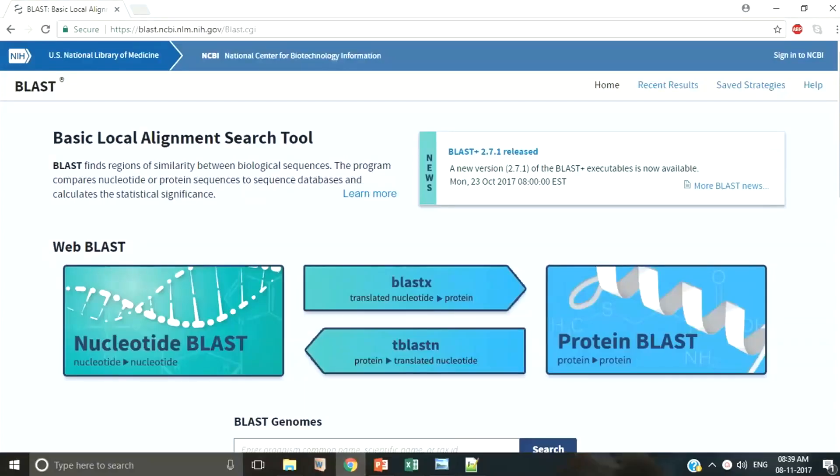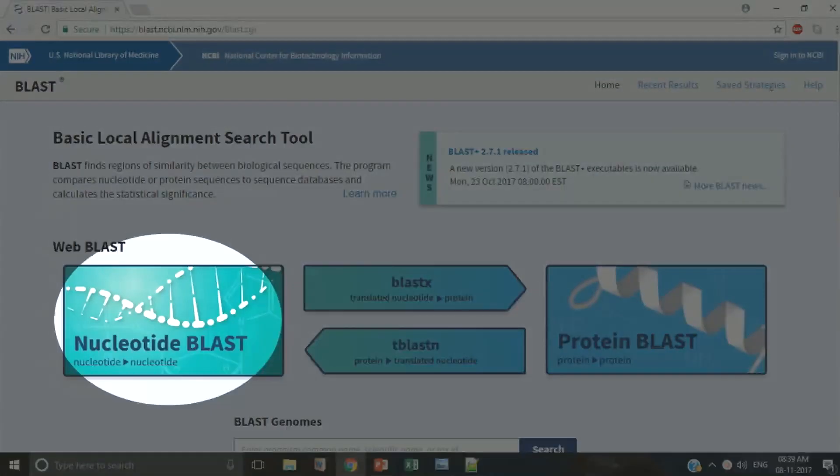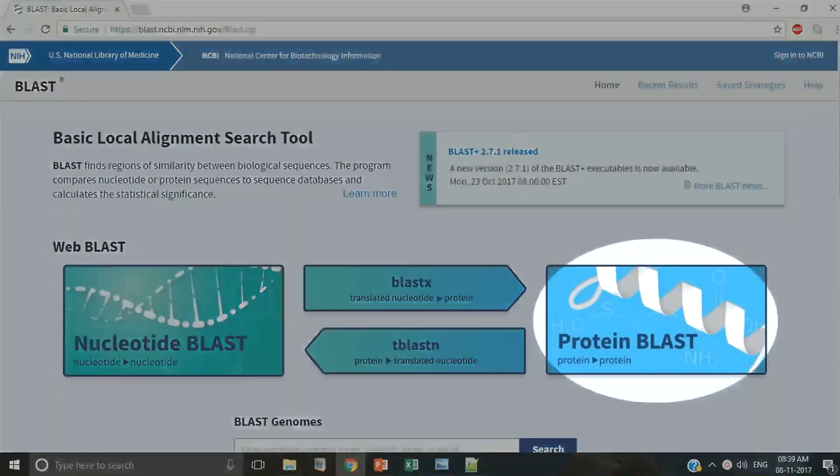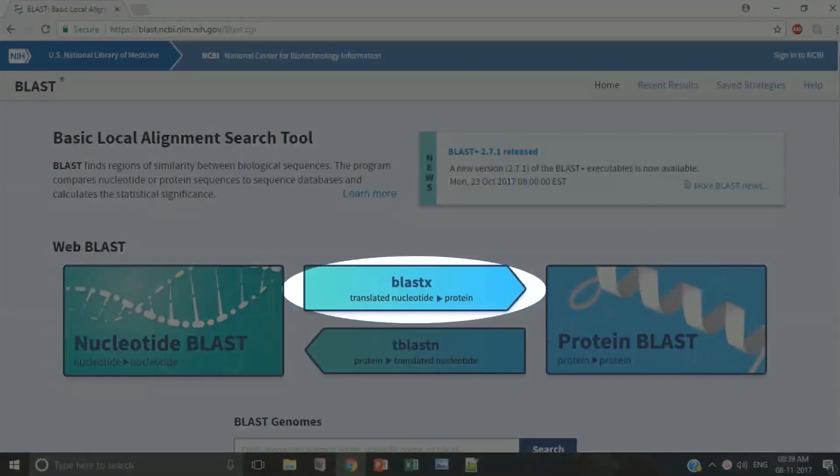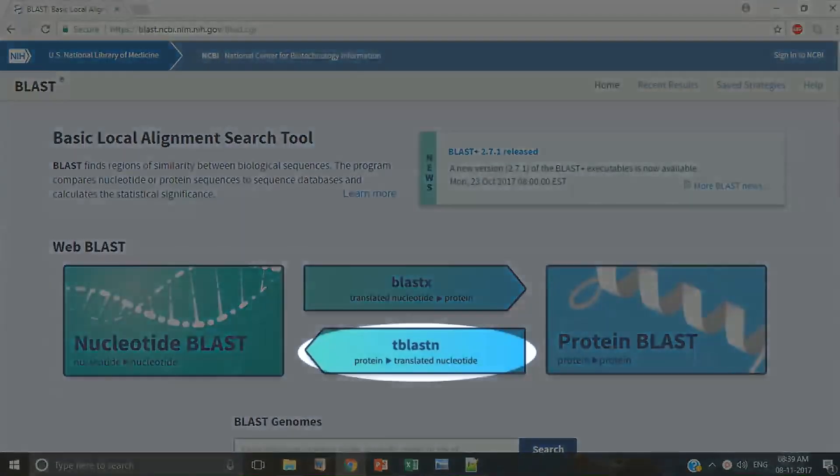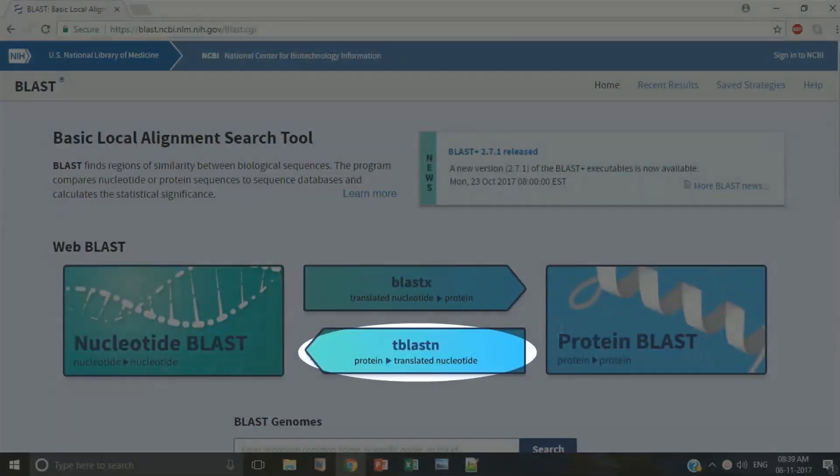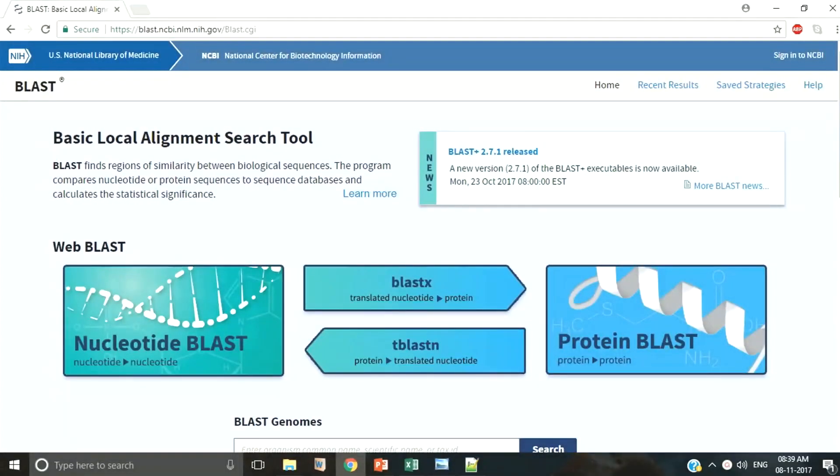This is the web interface of BLAST. There are four different types of BLASTs like Nucleotide BLAST, protein BLAST, translated Nucleotide to protein BLAST and protein to translated Nucleotide BLAST. Which one you are going to use depends on what sequence you have and what your aim is.